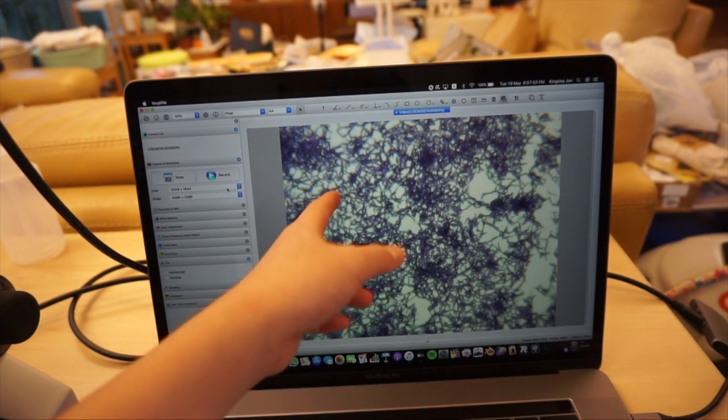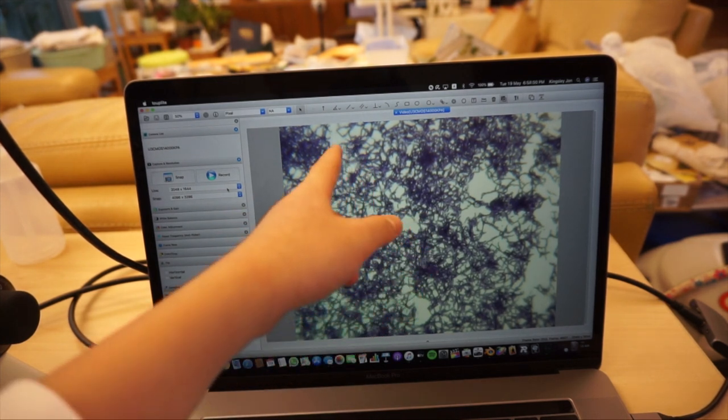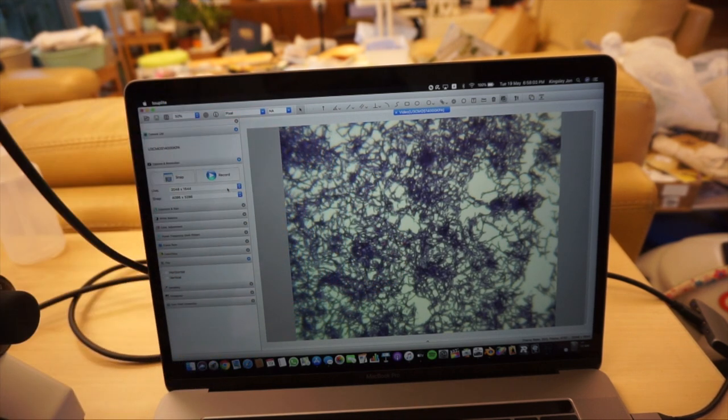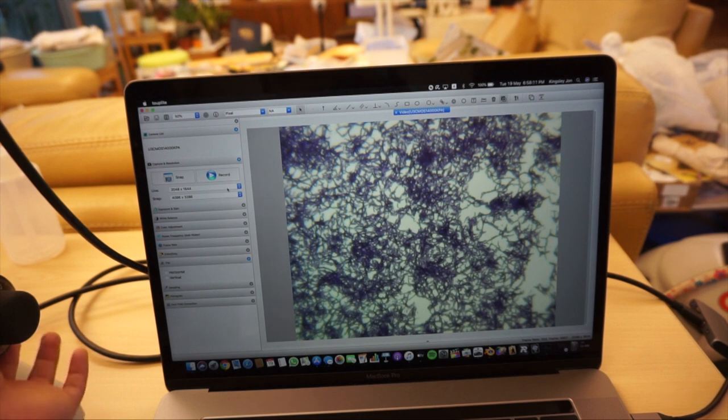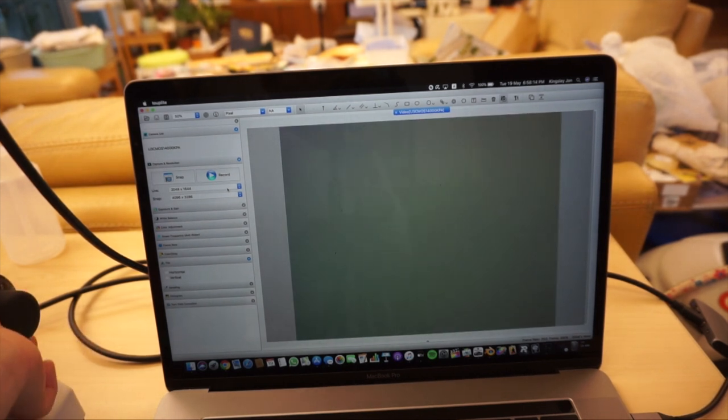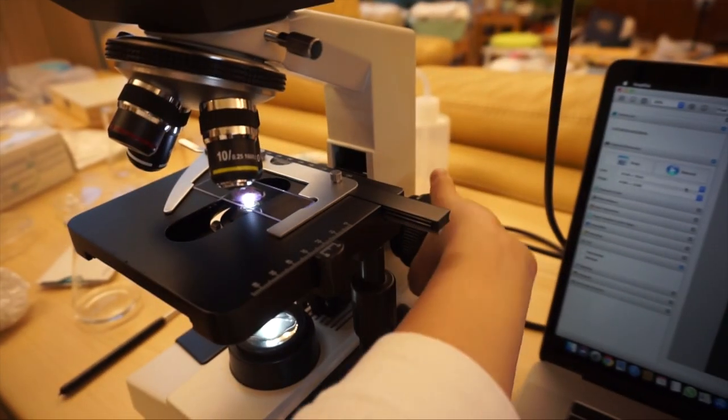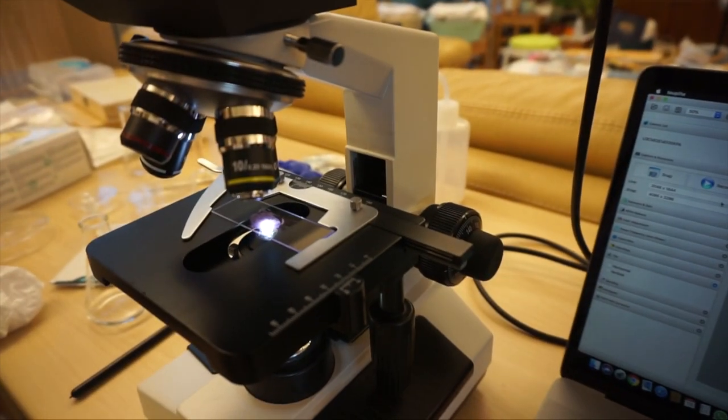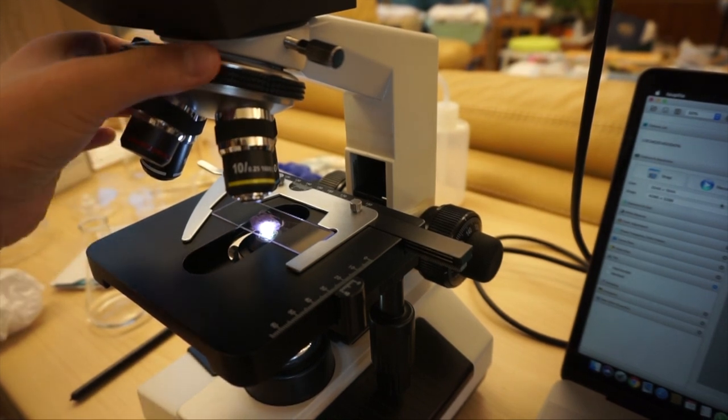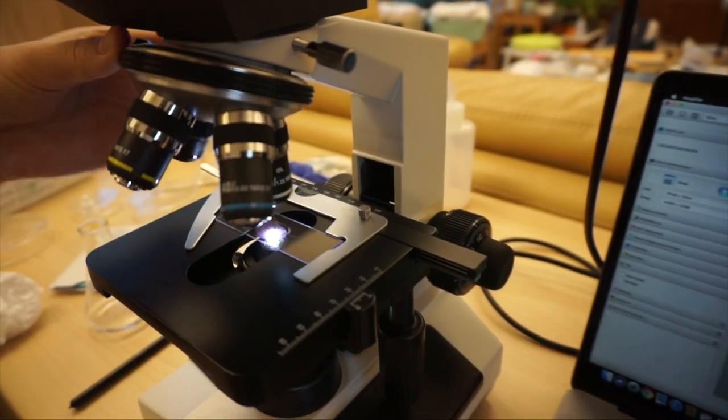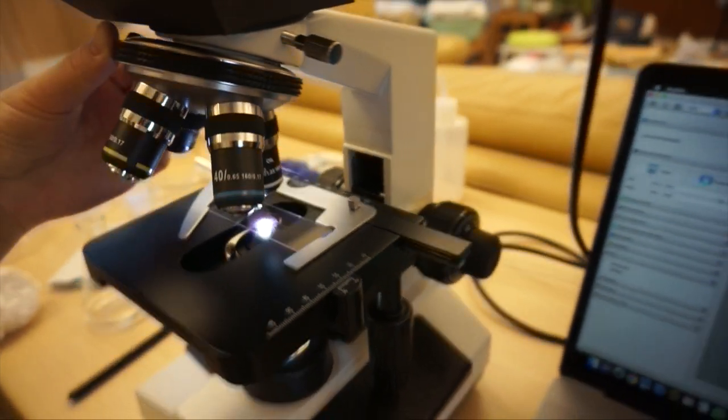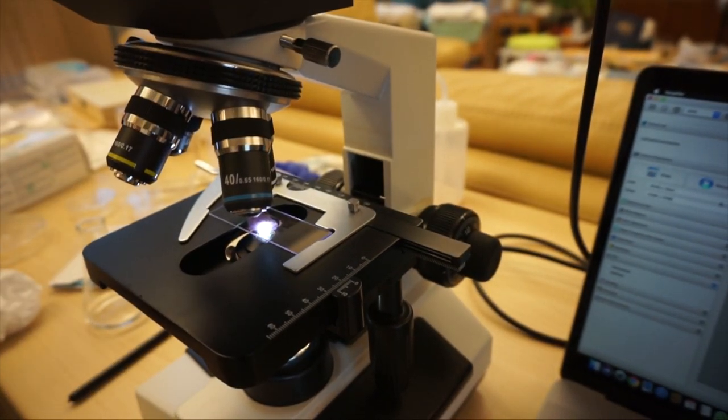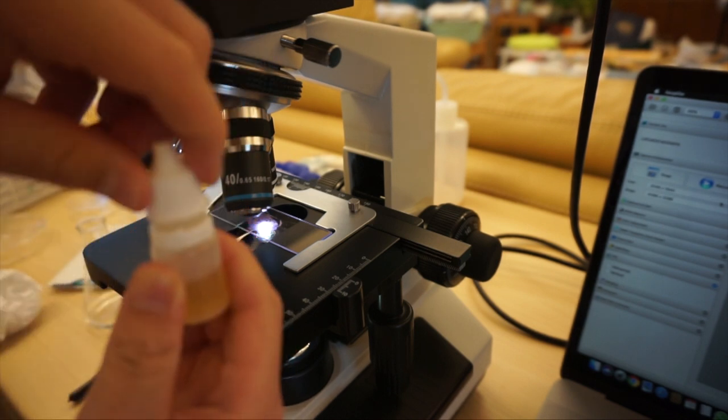Now lower the stage. Lower the stage. And then, actually turn it to the 100X oil. Make sure it's oil-adjusted. And then we take a drop of the immersion oil. Drop it where you, on top of the specimen. So try and avoid air bubbles. I'll actually go and do this to show you here.